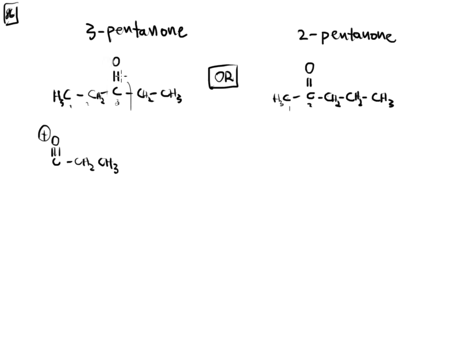The electrons move in, a triple bond gets formed, a positive charge tags onto the molecule, and I get this C triple bond O with 2 more carbons. That's exactly what I've written down here at the bottom. So I'm just going to put ×2 here to let me know, yes, I did check that choice, and yes, it's going to show up again statistically. It's got 2 options that it can use to form that fragment.